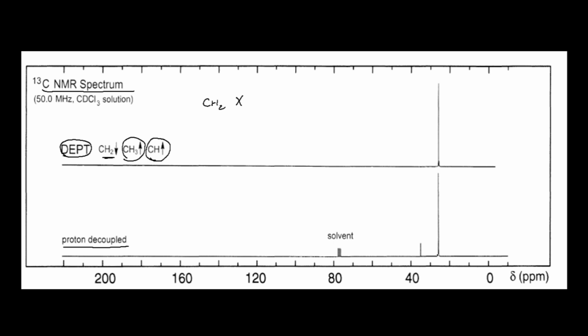If we see the chemical shift value, it comes in the range of 0 to 30, and in this range our methyl group is present. Here, these two peaks are at the same ppm value in the proton decoupled spectrum, so it means maybe the CH3 group. And this other peak has no peak area in the DEPT. It means in the proton decoupled spectrum, this carbon atom is not attached with any proton, with any hydrogen.